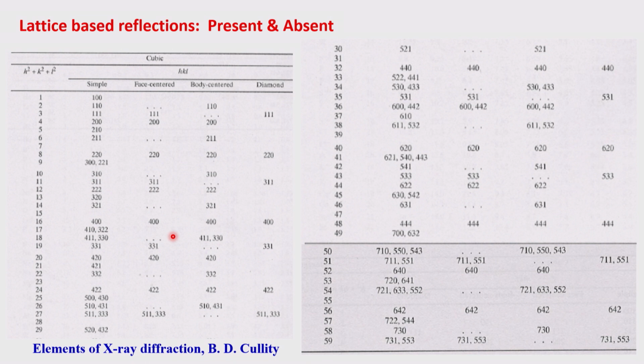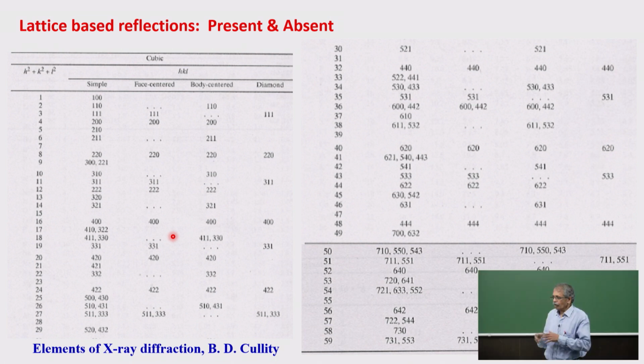Then using this data, how a powder diffractogram will look, how it emerges, and how it is digitized in the form of the diffractogram. We have looked at that, and what it finally stores, and how you interpret it. These intensities and theta values should be converted into d, into sine theta values, and the HKLs, and the lattice parameters, all of those, and their refinement. Then using just a simple combination of these powder diffractions, you can get a diffraction of a mixture, and you can identify the mixture, and you can quantify that mixture as well, with various examples.